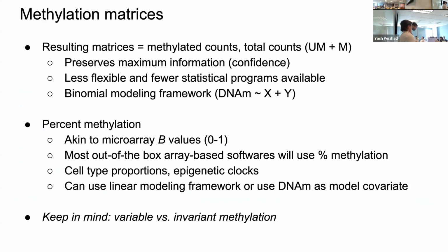Which is basically a reason to use the first bullet point. Yeah, because then you actually have the count. So what I said was applicable to the arrays, but instead it is actually better to take the sum of the methylated reads in that region divided by the sum of all the reads in that region. Yeah, exactly. Then you would not get 40, you would get closer to 60, I think, as an example.